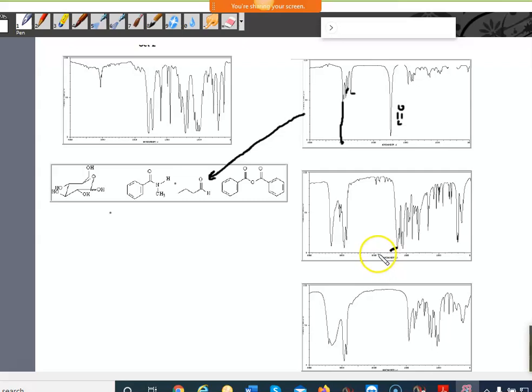So that one's a little tough because that carbonyl is a little lower than usual. But it's really the only thing, so it'll match that one. If I did not have that molecule, this would be a little tough to analyze. You would have to be given more information.